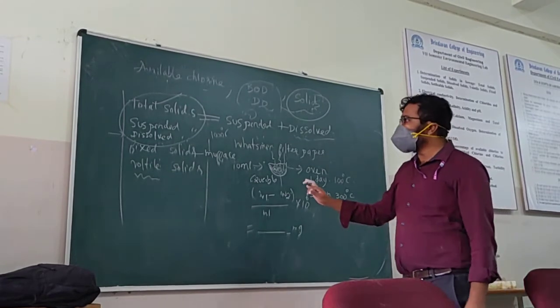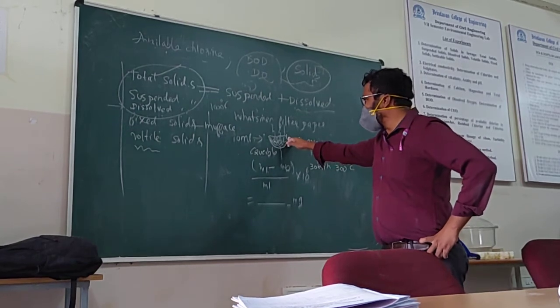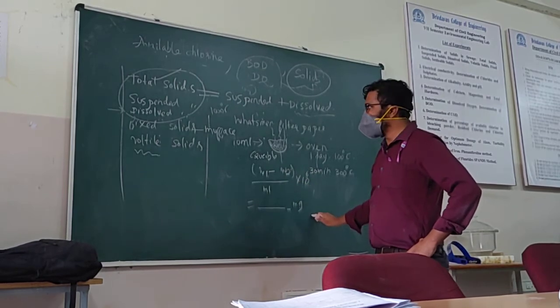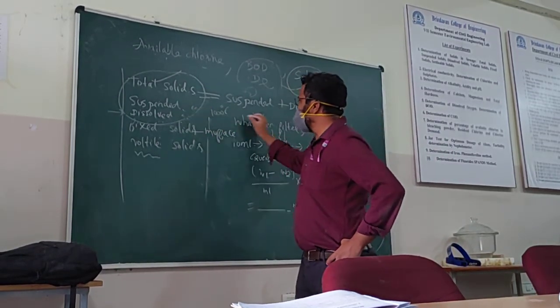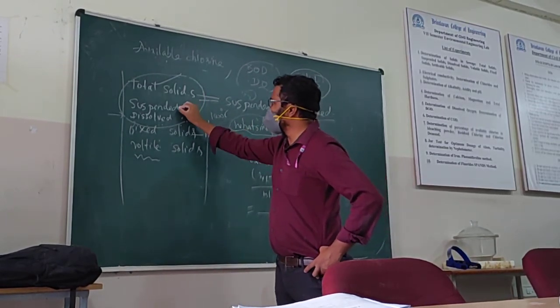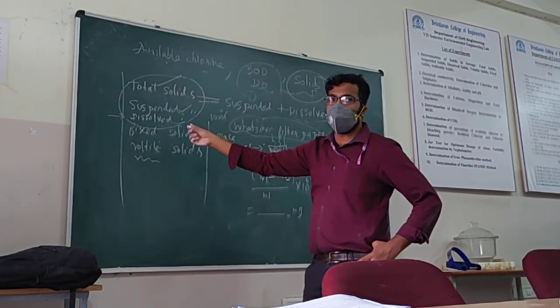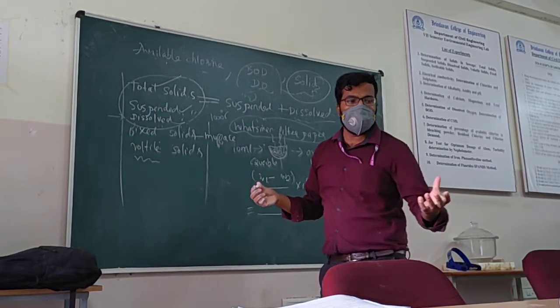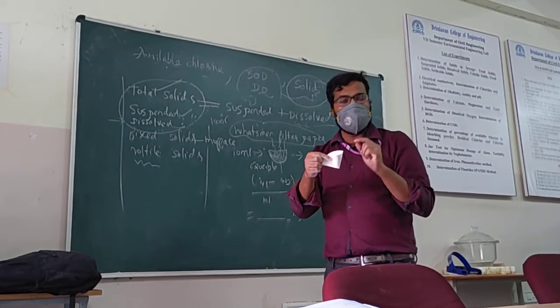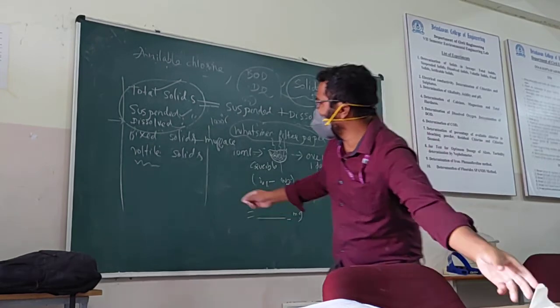Okay. So here, no titration, nothing. You just have to find the initial weight and put it in the oven. Find another weight, put it in the formula. You will get the answer. So for these two, you are using this Whatman paper. Like total solids, you can find the dissolved solids, and for suspended solids you just put the paper only in the oven. Okay. Some solids will be deposited. Find the initial weight, and after taking out from the oven, find the final weight. So that's suspended solids.